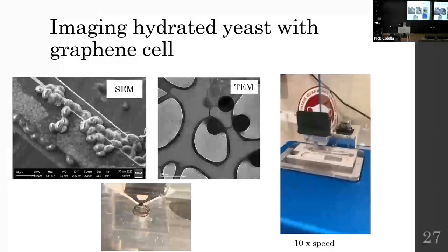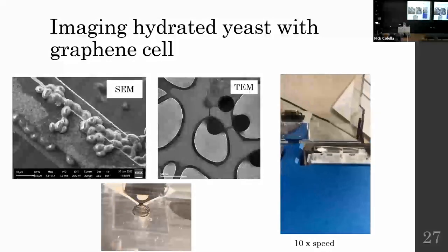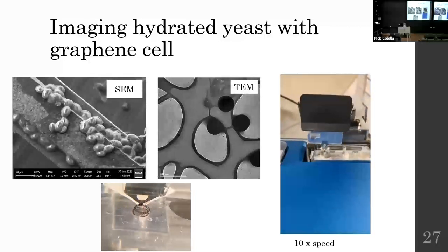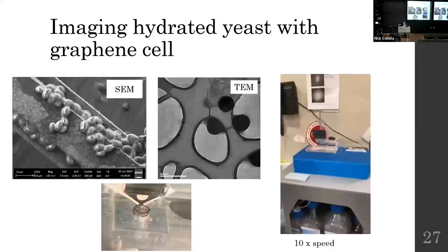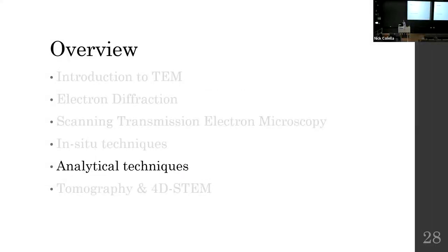where you can see the equipment in motion. So it's picking up some graphene. We just drop cast our little solution. And over goes the robot there, which is just going to drop on our lid of graphene. All neatly done. And it works perfectly like that every time. Just don't ask Austin. Austin is the person you want to contact if you want to use that.